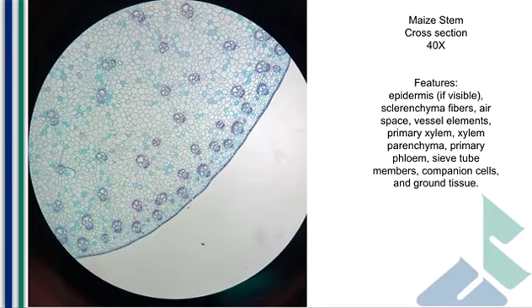But monocots have individual strands of our vascular bundle placed irregularly throughout the stem. So you do see somewhat of a trend where there's a lot placed on the outside, but there are vascular bundles placed internally to them. This is one of the features that prevents secondary growth in our monocots.